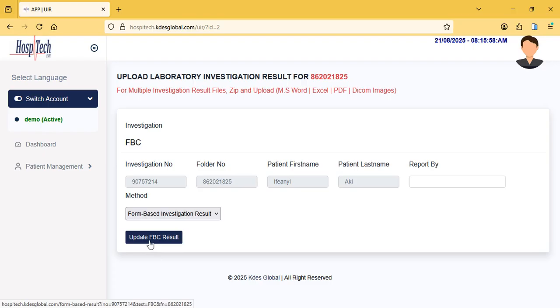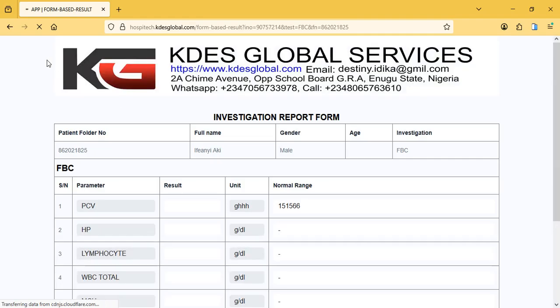They will just be there for you. But in this case, it's just one. So we open it up, and you can see a nice generated form with letterhead. You have to update your own letterhead.